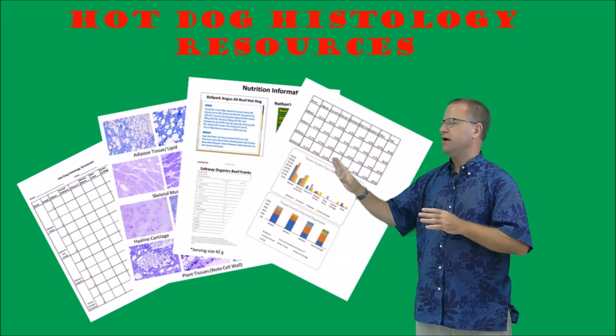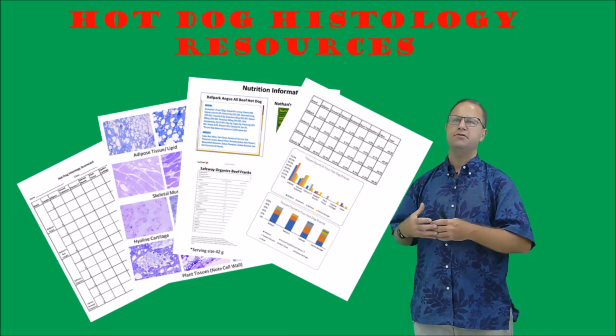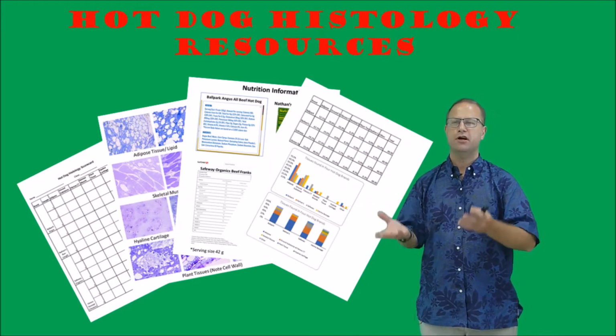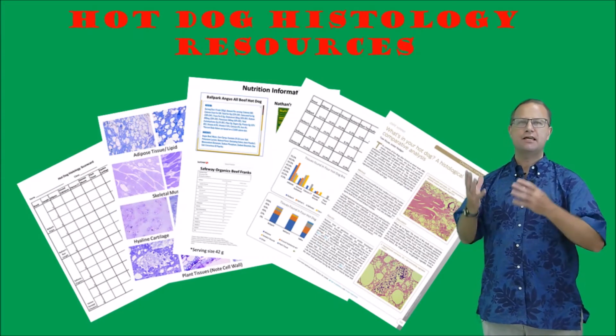In addition, we also have a really neat spreadsheet in there that once you enter your data is already going to do the calculations for you and estimate the proportion of adipose tissue, muscle tissue, etc. It's even going to generate some pretty cool graphs that you can share with your class. And finally, there's a couple of research papers that have been done by scientists asking the exact same questions that we are today.